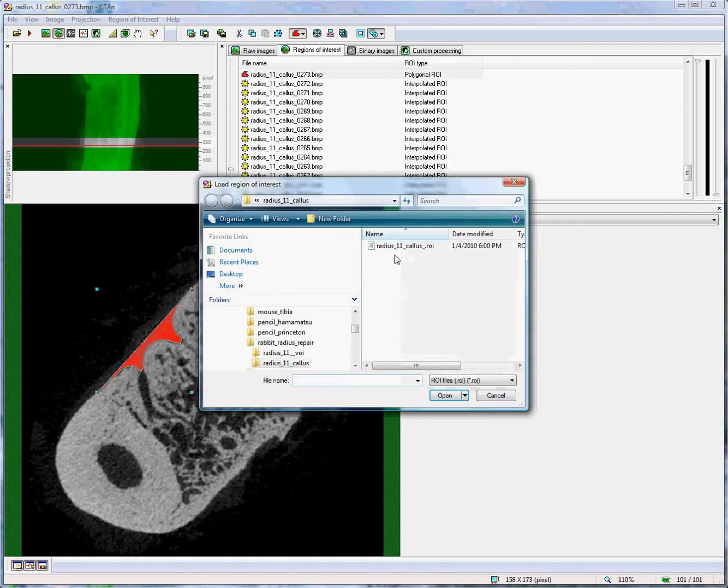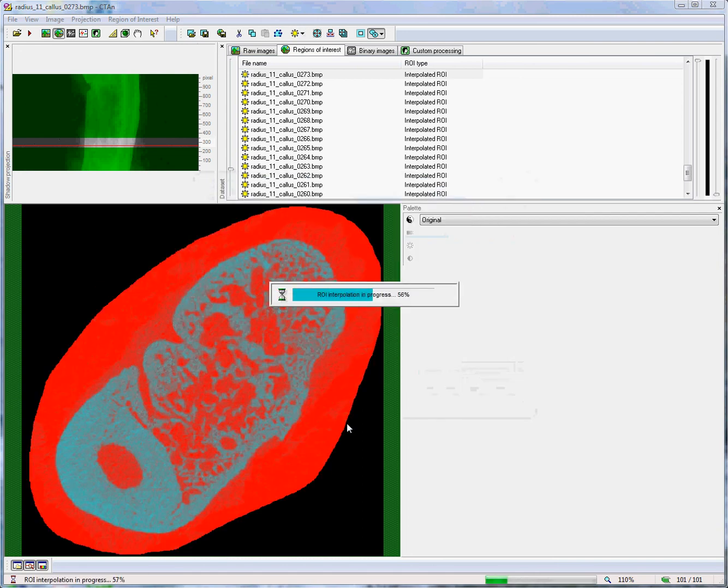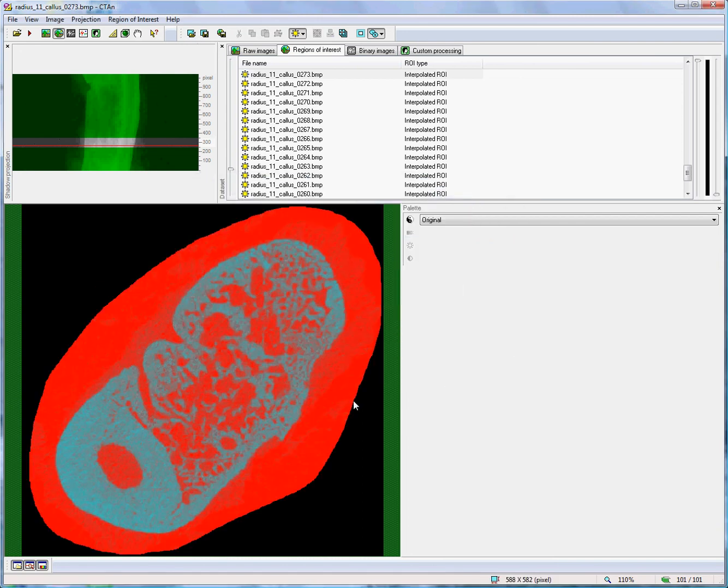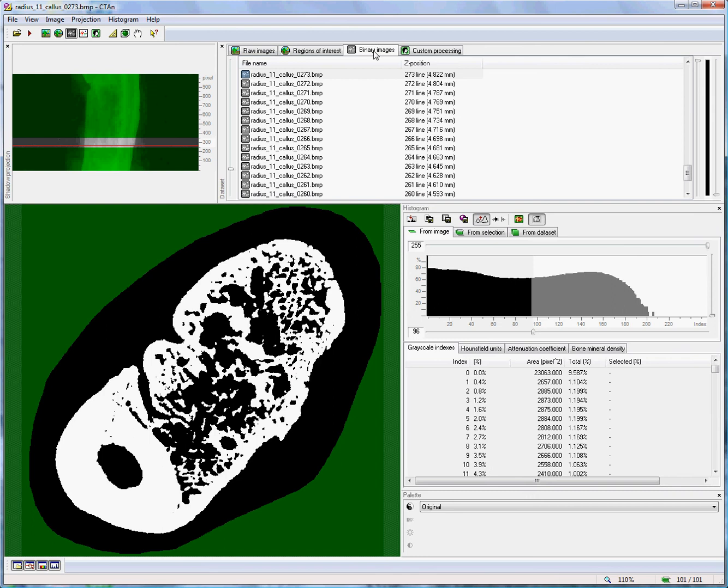So let's load the very loose region of interest which goes around the outside of the object but not following the boundary contours. First of all, at the binary image page we choose a threshold to segment the bone.